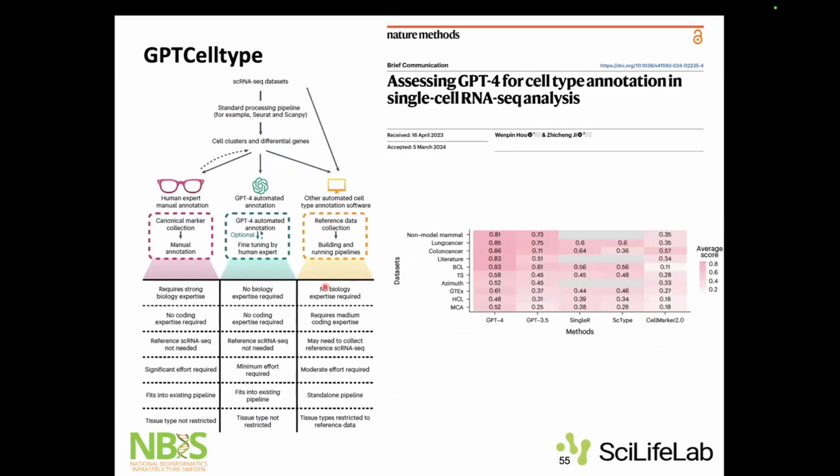The other effort that I had seen, there was a paper on it, where people try to use ChatGPT for cell type annotation. So we know that the traditional way was that you need a human expert who will sit and do annotation based on the markers. But what they did here is that they use ChatGPT instead. So it's just like commands, different commands that they use.